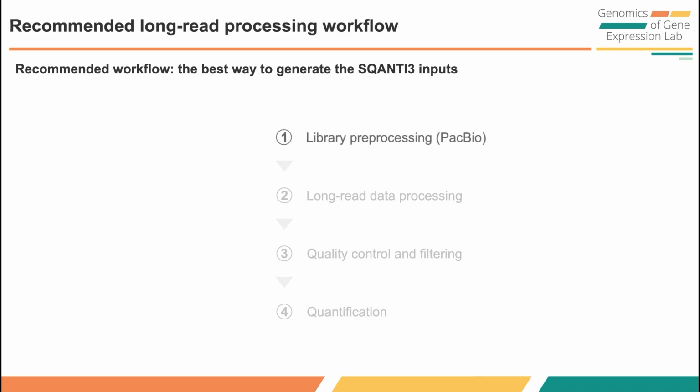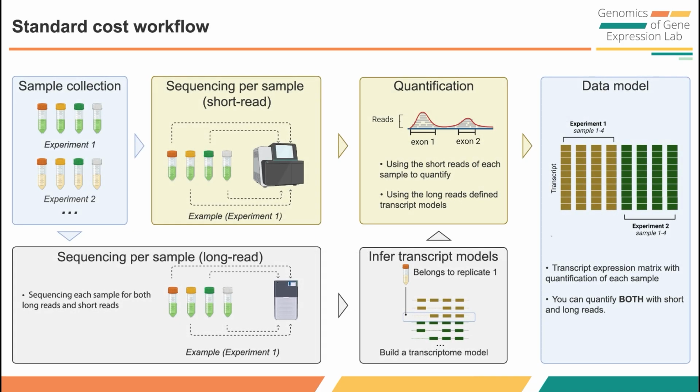Let's start with the library processing based on PacBio single-molecule real-time sequencing. Based on your budget, we have different recommended workflows. Here is an example of the standard cost workflow.